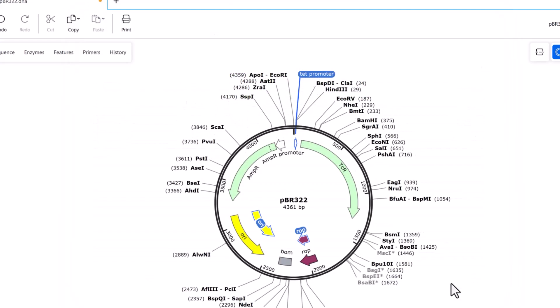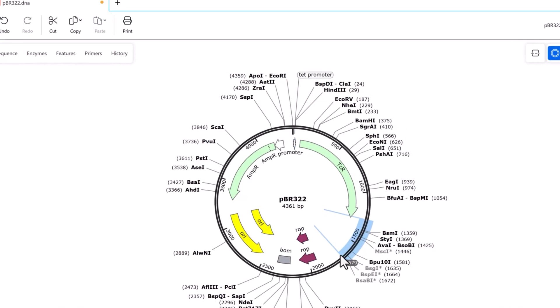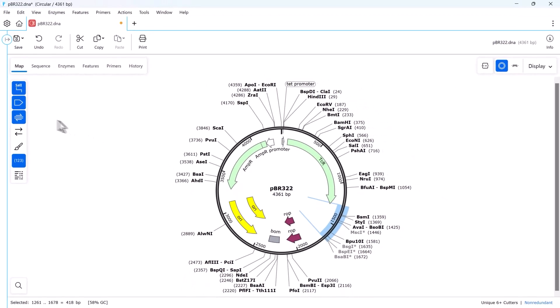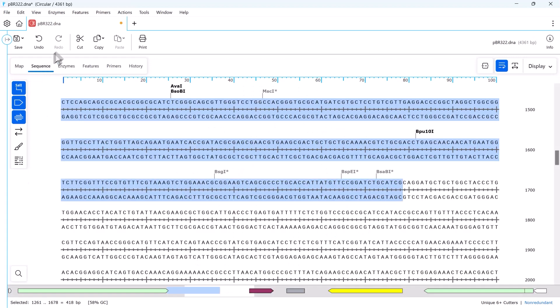You can also create new features by highlighting the relevant area on the plasmid map or the sequence view and choosing add feature.